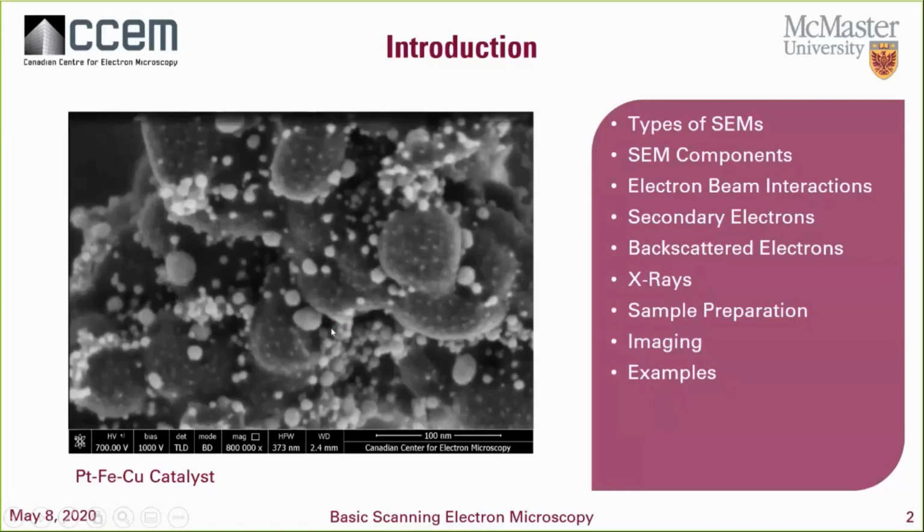Okay, what is the best practice or material for coating biological samples at high vacuum condition, and any tips for imaging? One of the problems you get with coatings is how visible the coating is. So it really depends on what magnification you need to go to. If you're not going above 30,000 times magnification, gold, platinum, gold-palladium, chromium, and iridium can all be used. Gold is the most common. Carbon is sometimes not as good as the metals for coating. As I said before, though, it's important that you have a connection to ground.